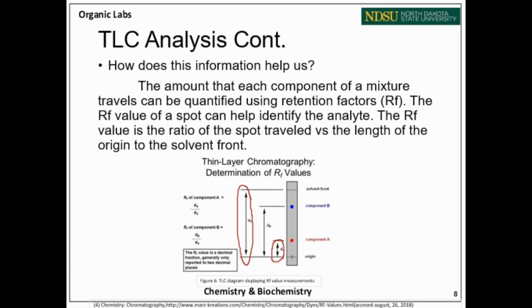You can then use this retention factor to compare to a known standard to identify what component A is or most likely is.